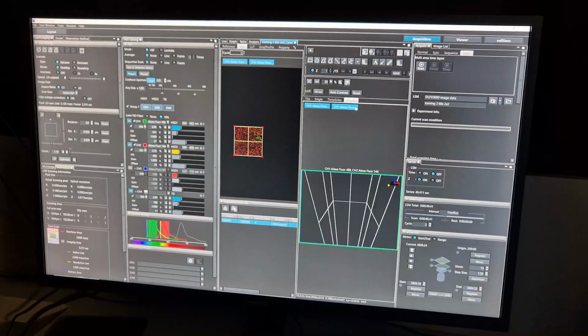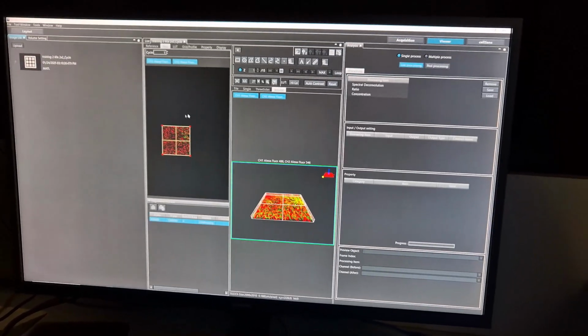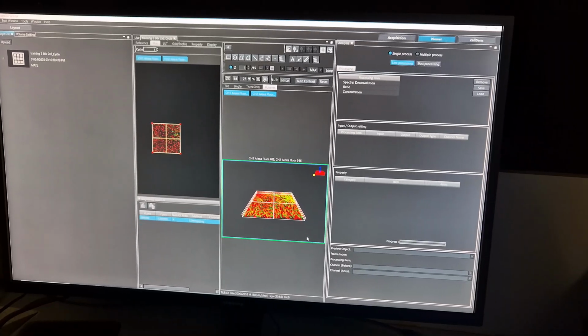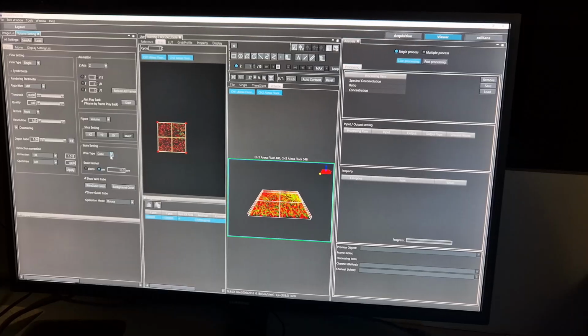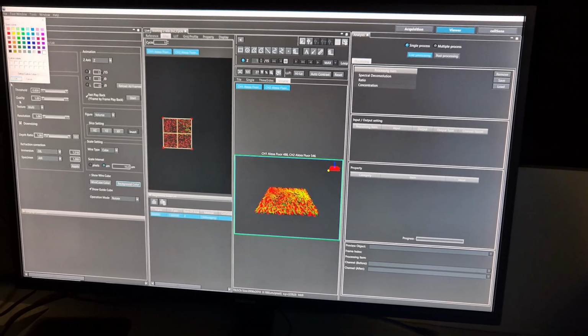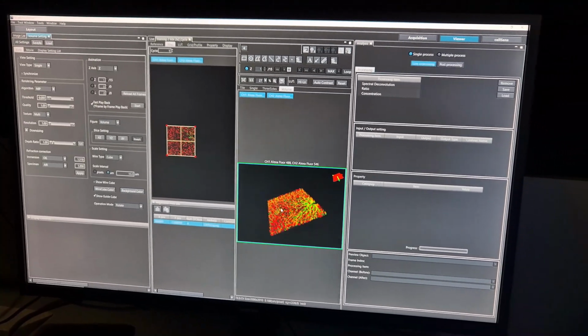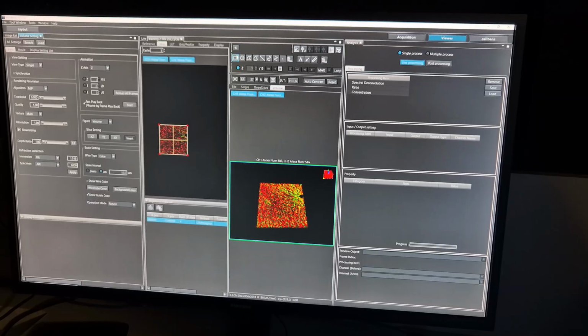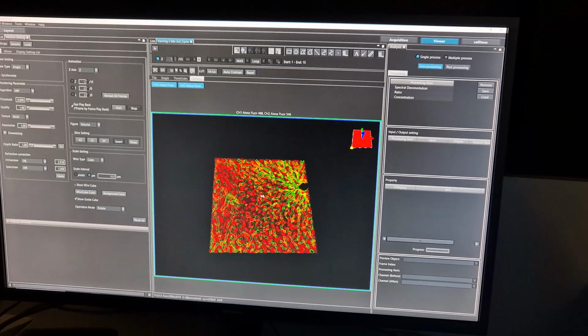We can do the volume view again. With the volume, it's recommended you go into the viewer and use the volume settings. Check here, and take the wire cube off. Background is black. Okay, and then let's put a bigger image on the screen.